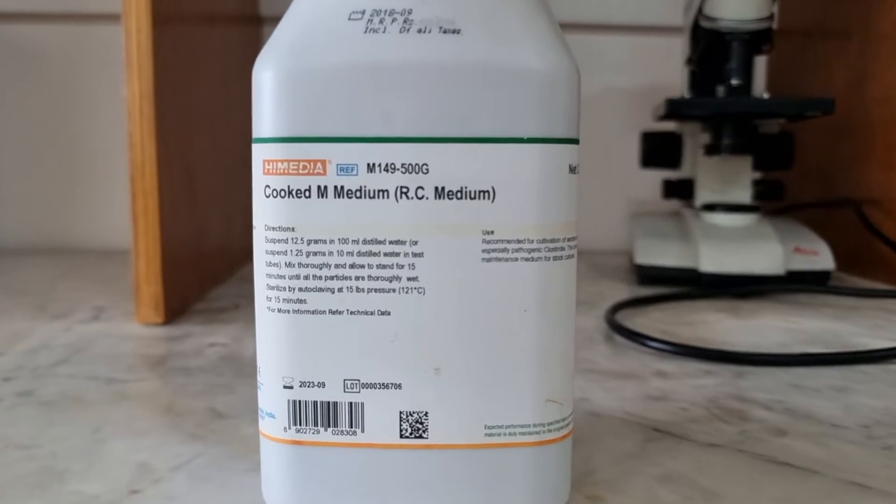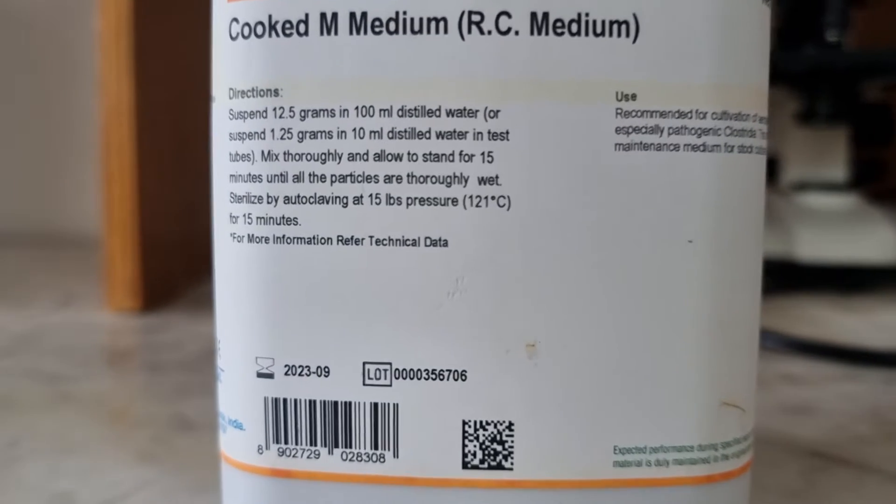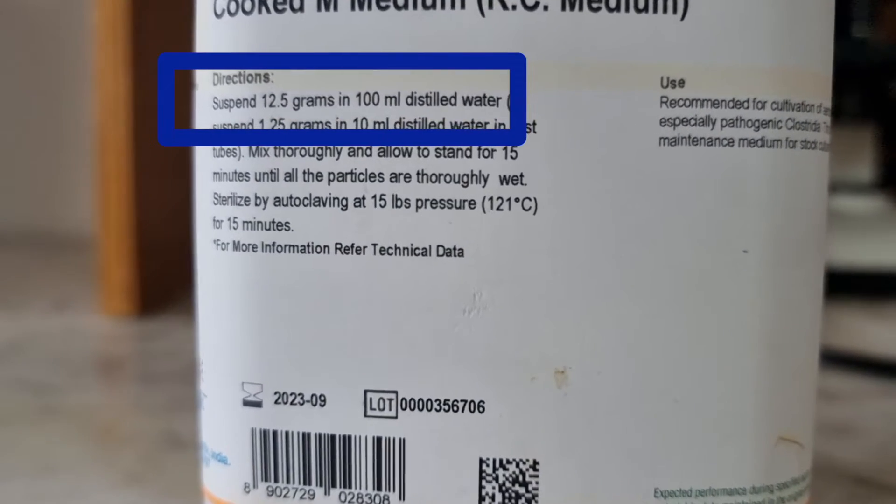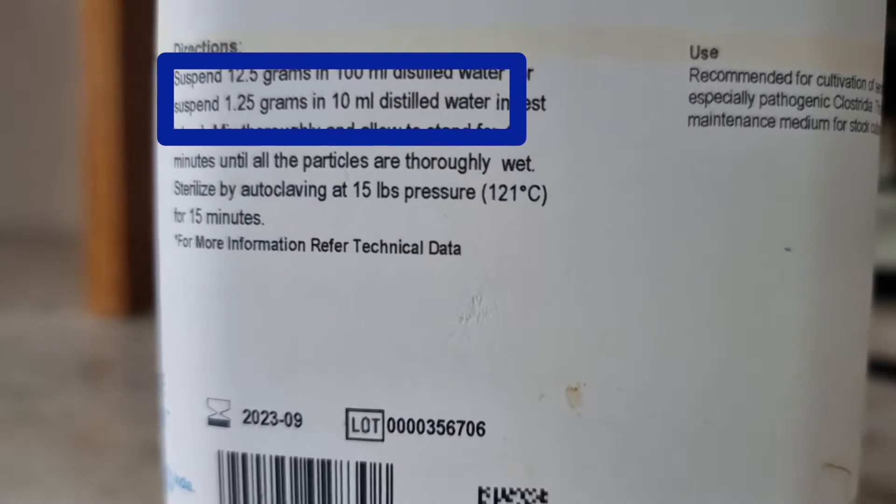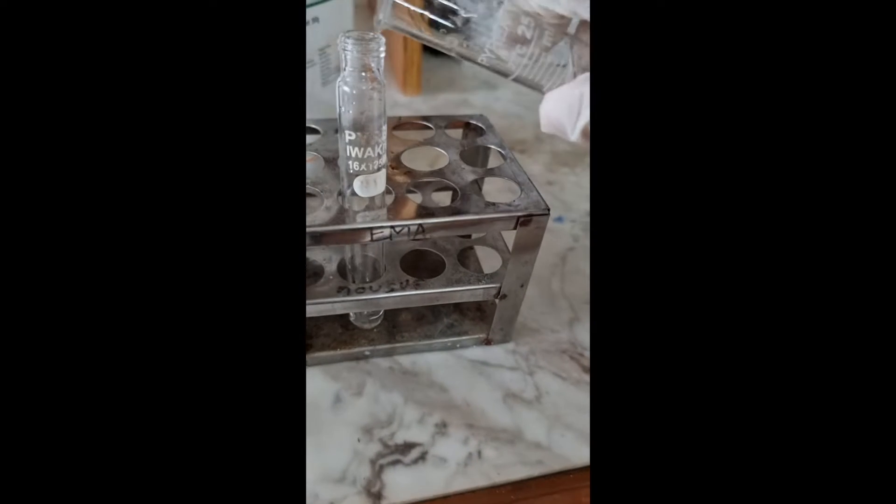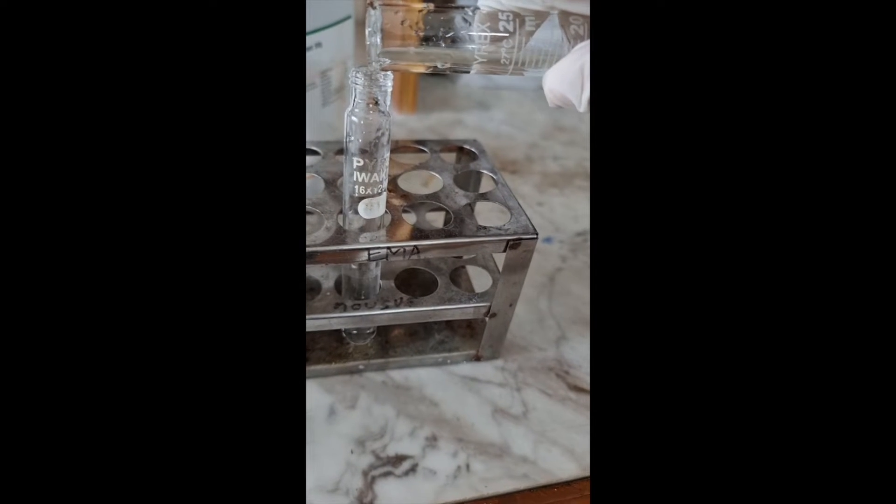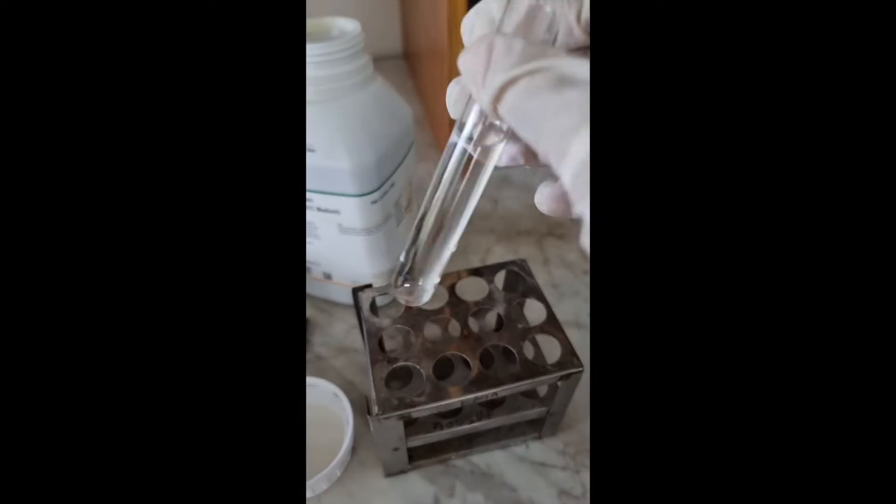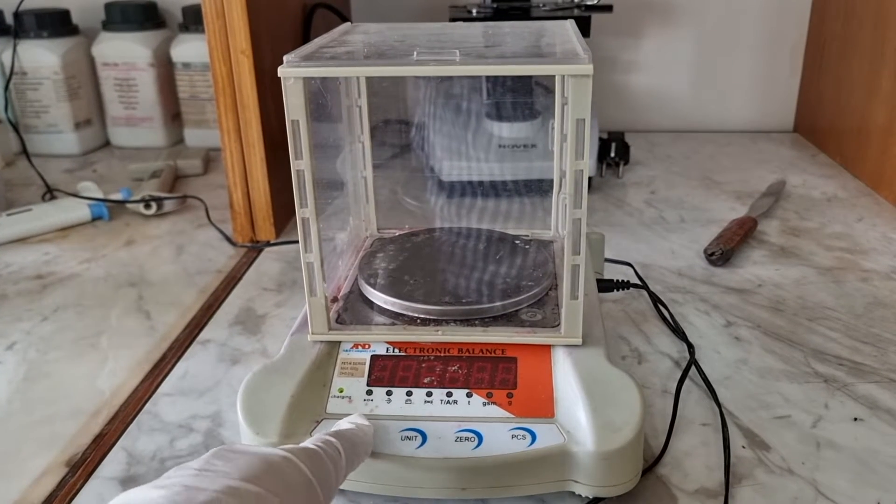Here is our Robertson's cooked meat media. We need to suspend 1.25 grams of the media in 10 ml distilled water and transfer it to the test tube in which we will mix the media.